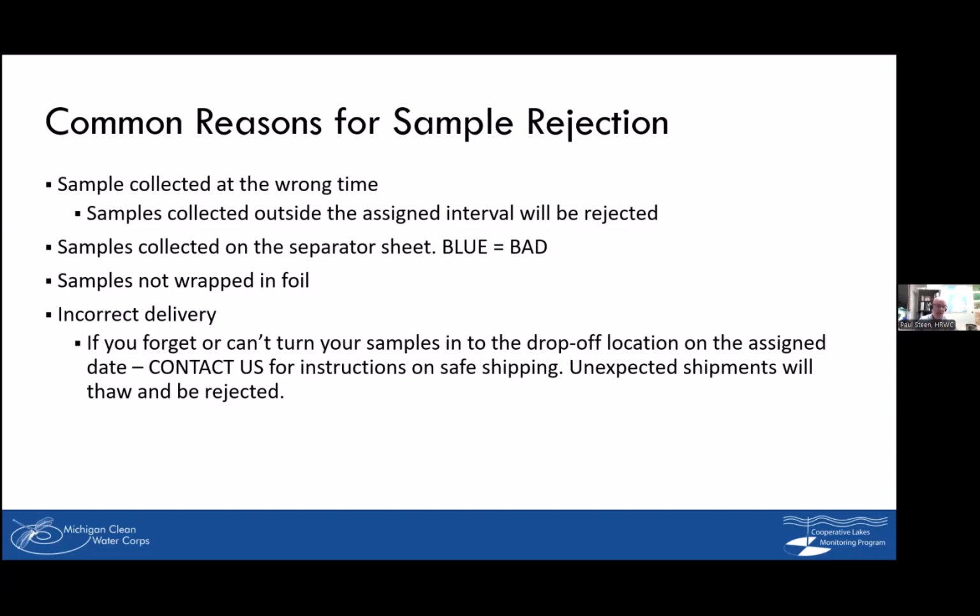And then finally, incorrect delivery may ruin your samples. So if for some reason you can't follow the standard directions, which are to turn your sample into the turn-in locations on that particular date and time, you have to contact us to get alternative instructions.